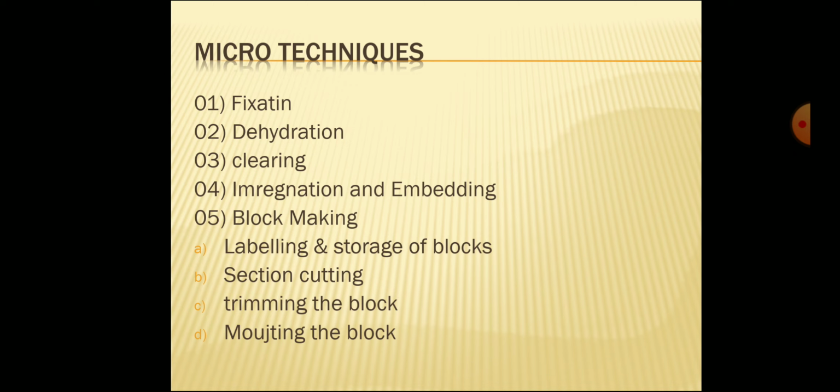So it should be used in the proper way for the removal of the alcohol. The good characteristics of a clearing agent are that it should be miscible with alcohol. It is easily removed by melted paraffin. It should not produce excessive shrinkage, hardening, or damage of tissues. It should not dissolve aniline dyes and it should not evaporate quickly in the water bath.